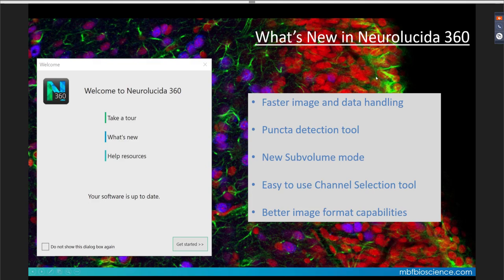When you open Neuralucida 360, clicking the 'What's New' icon brings you to a well-written page detailing the new features. This has been a multi-year endeavor — there have been major overhauls to how images and data are read, resulting in blazing fast speeds. We've seen results up to 5,000 times faster for opening images.